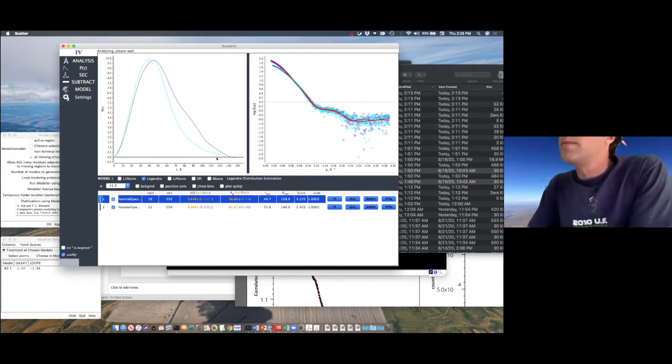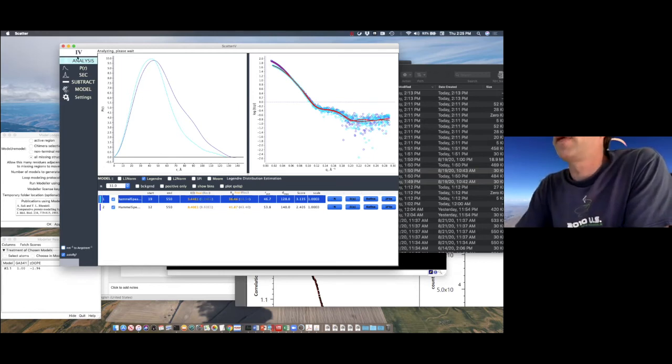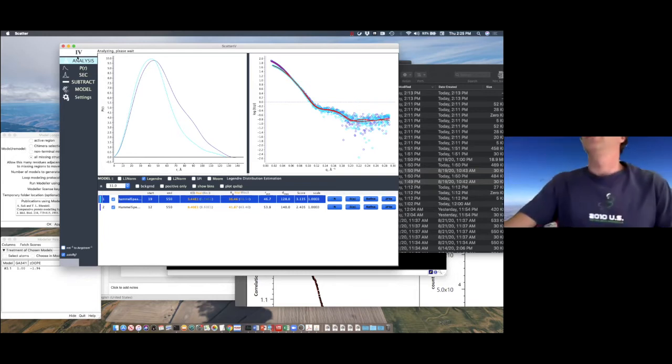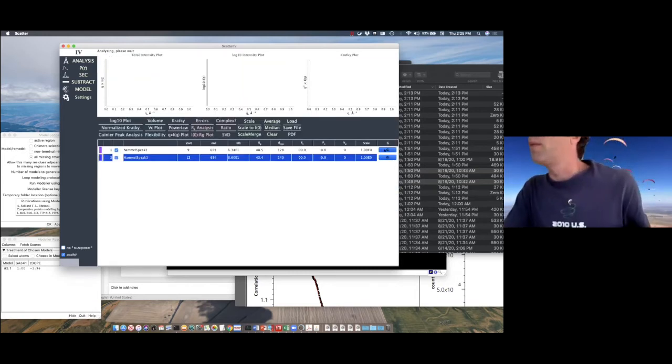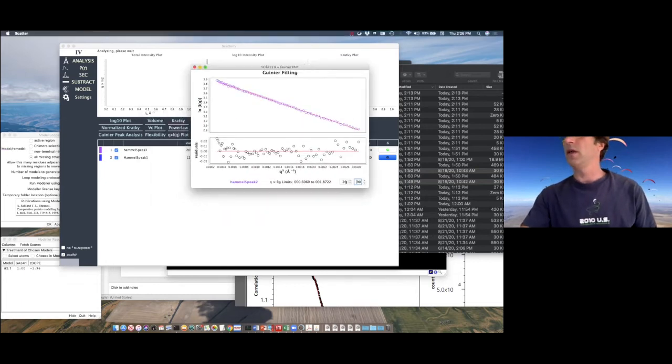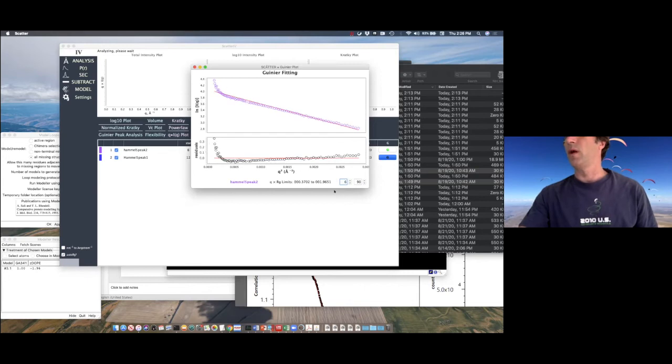Okay, so in this case, I didn't click on RG, so we need to go back. That's probably what somebody, Andy, pointed out. So we need to go here and properly calculate the RG. This is wrong because we have the capillary falling, so we have to cut the data as much as we want, and it's linear. Then you see, I cut 20 points, and I get rid of the problem with the capillary falling.